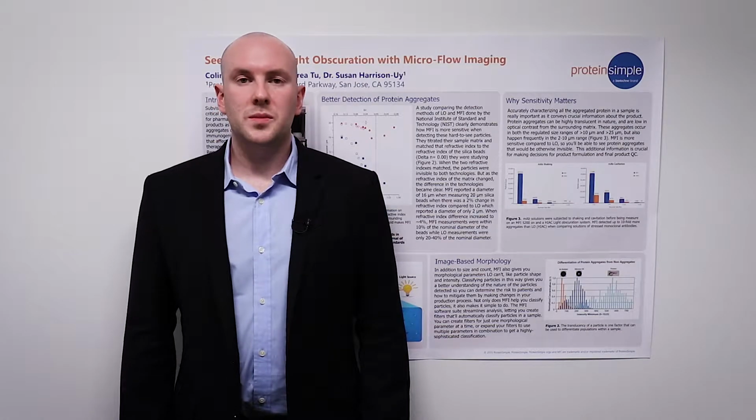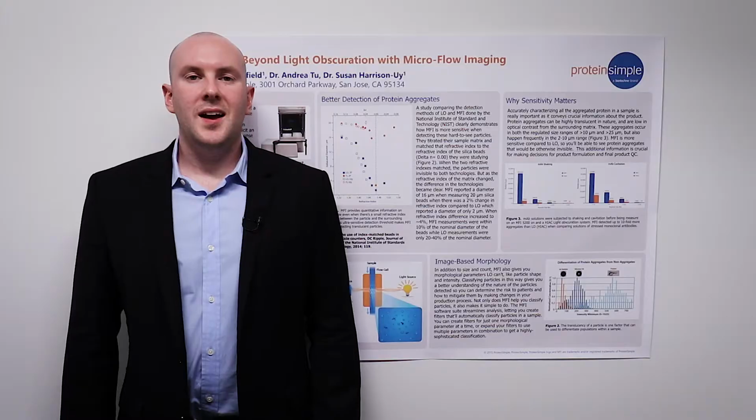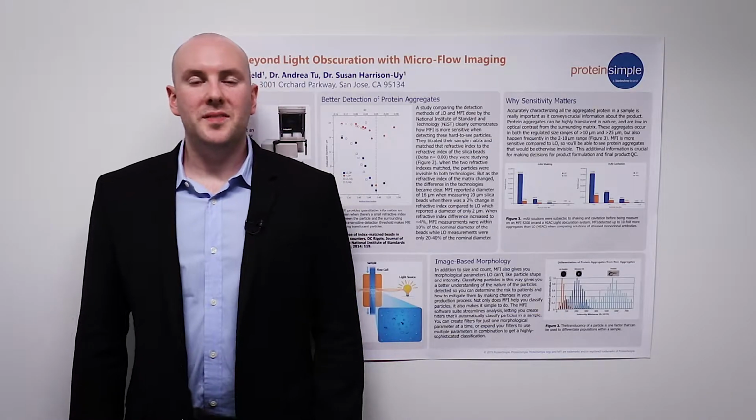Modern biopharmaceuticals present unique health risks such as immunogenic reactions, and they also have unique challenges when it comes to characterizing the subvisible particles within them, and these are inadequately addressed by light obscuration. This poster will be focused on demonstrating how MFI provides some of the crucial information that light obscuration misses. To begin, I'd like to talk a little bit about how MFI works.